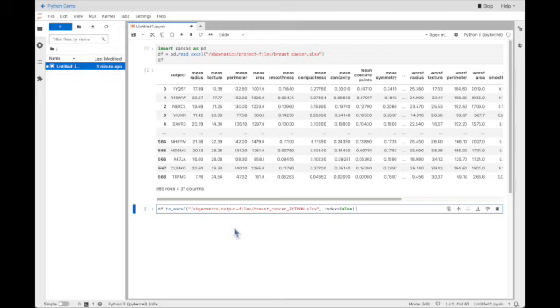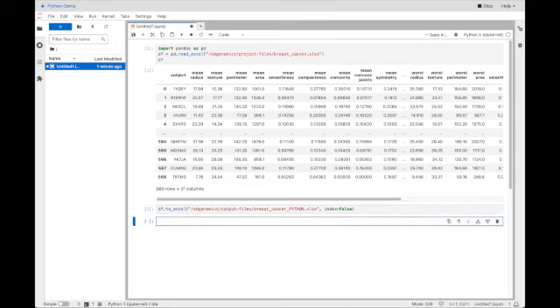To write back to our CGC project, we'll need to write to sbgenomics/output files. So that's output-files/ whatever you'd like to name it. Again, I'm just going to name it breast_cancer_python so that we can differentiate it from the original file. Once we're ready, again, we'll execute this command, and this will save to our CGC project.